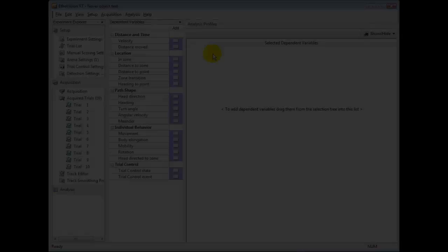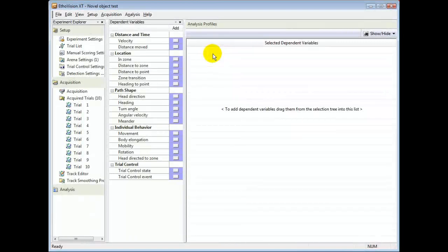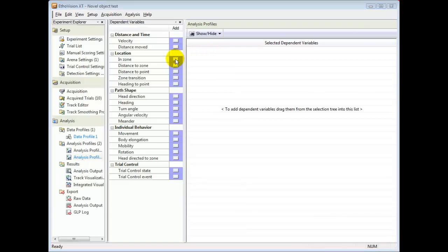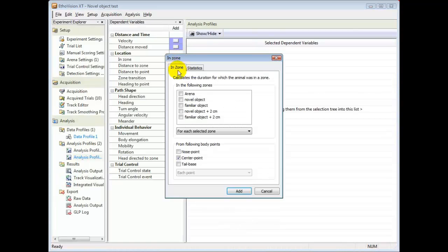If you select the INZONE variable, you can calculate how often and how much time the mouse was investigating the novel object.